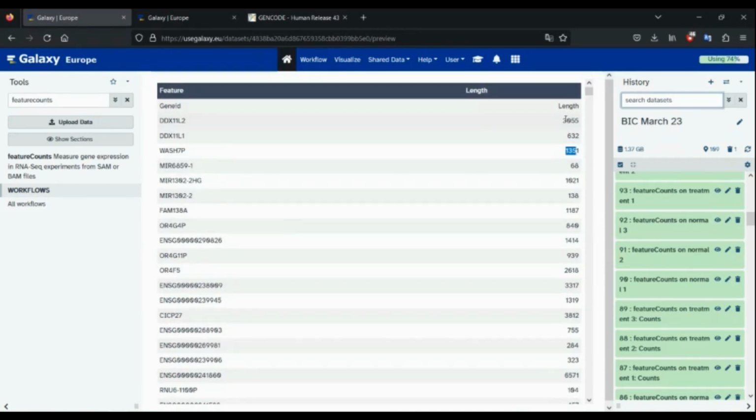So if you think about it, this says 3055, but we know that our reads are only 155 in length. How did this 3055 come about? Well, it's because we're not just finding a feature of one single gene that aligned to this region. It could be multiple, right? So that's what it'll give you. And also, it's not just the length of the file that is actually present. It'll give you the length of the entire gene, because remember, this gene doesn't even show up in our list, right? But it's showing here because this is the overall length of the gene. That's simply what it is.